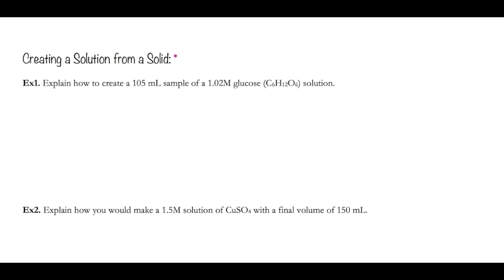And so if I want to create a specific solution that has a certain concentration, the way that I make those solutions is going to be different depending on if I have a solid versus if I have a solution already, a concentrated solution. So the first thing I'm going to explain is how to create a solution if I start with just a solid.